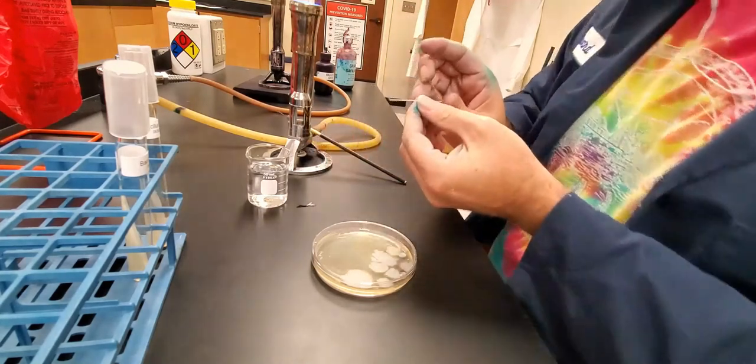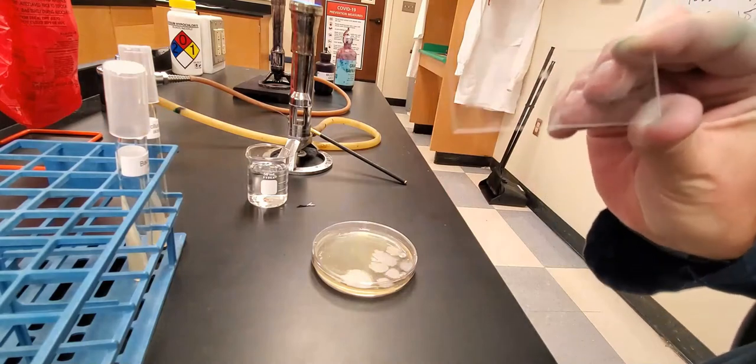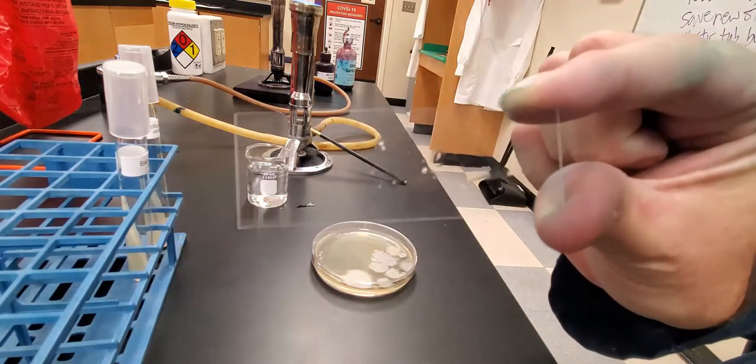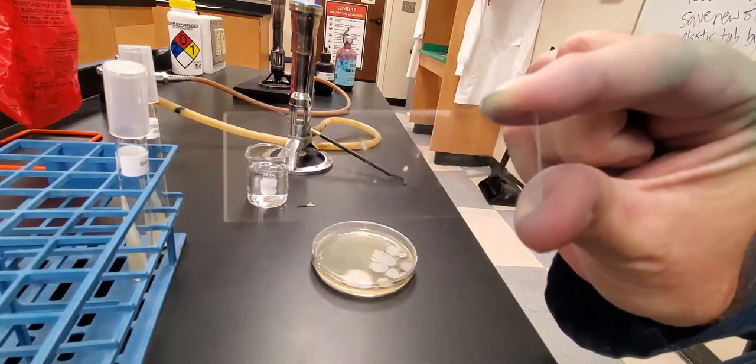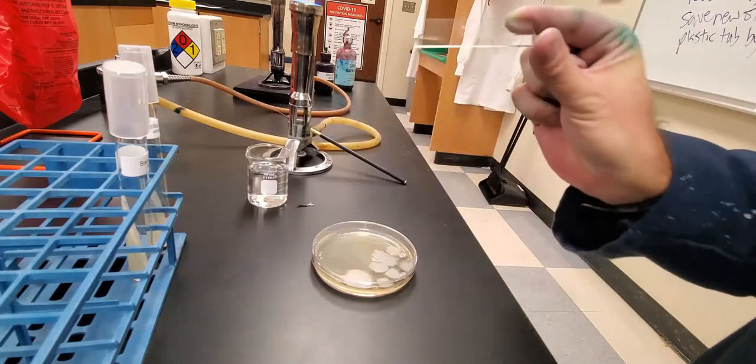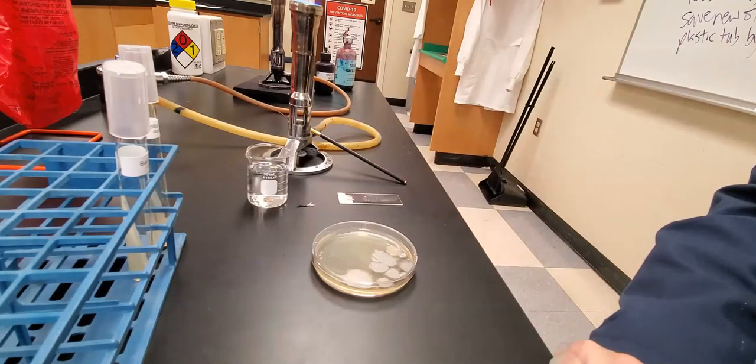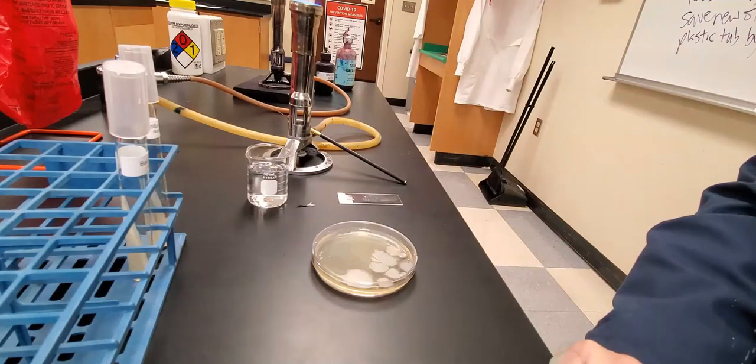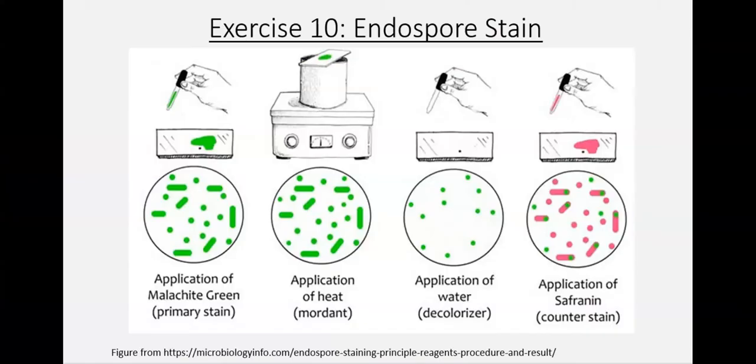You can see the smear that we have here. The one that I pulled off the plate, you can see a little chunk of that right there. We're just going to let this sit for a few minutes so that the cells will have a chance to air dry.